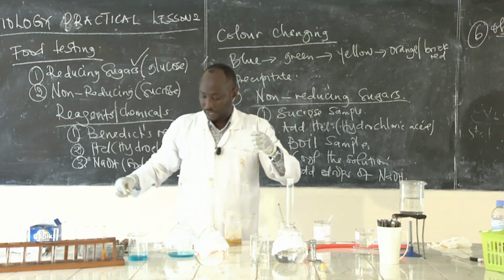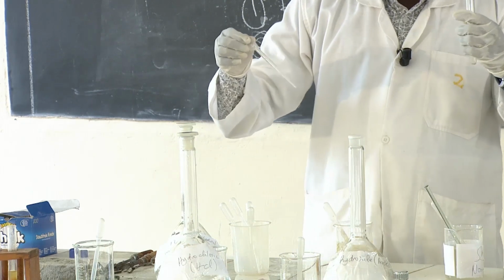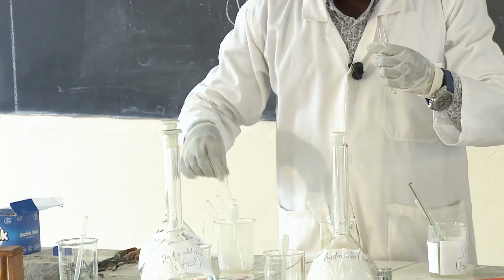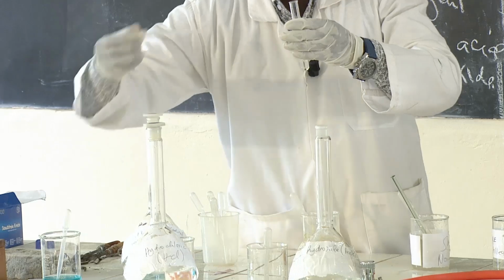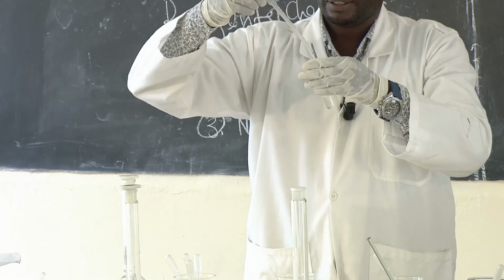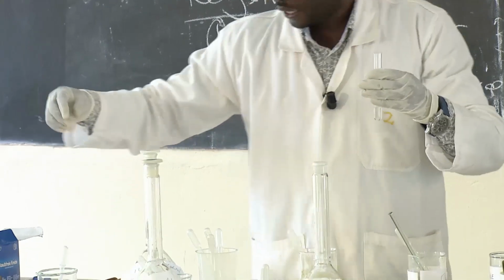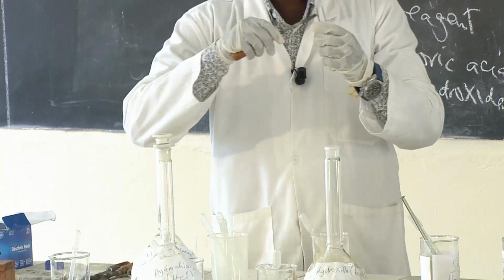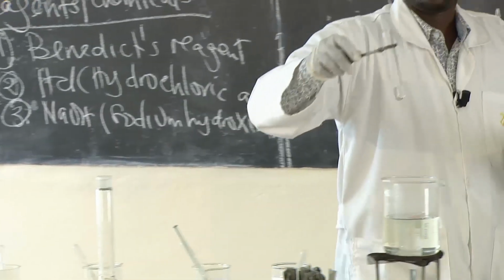Then I get hydrochloric acid. I add some drops of hydrochloric acid. After putting it there, I need this. Then I put it into a water bath.